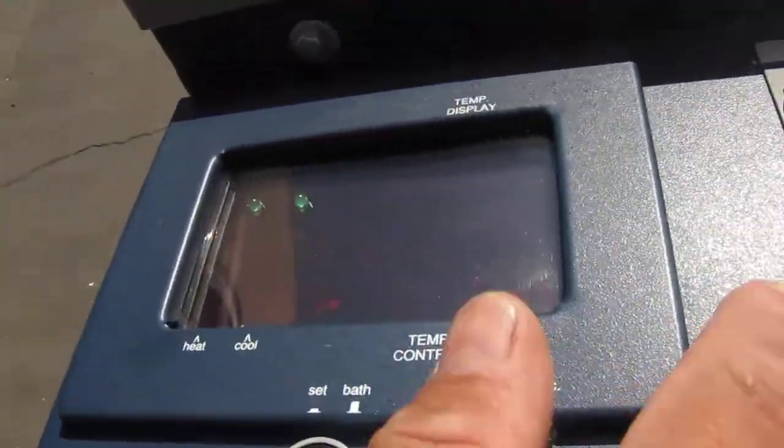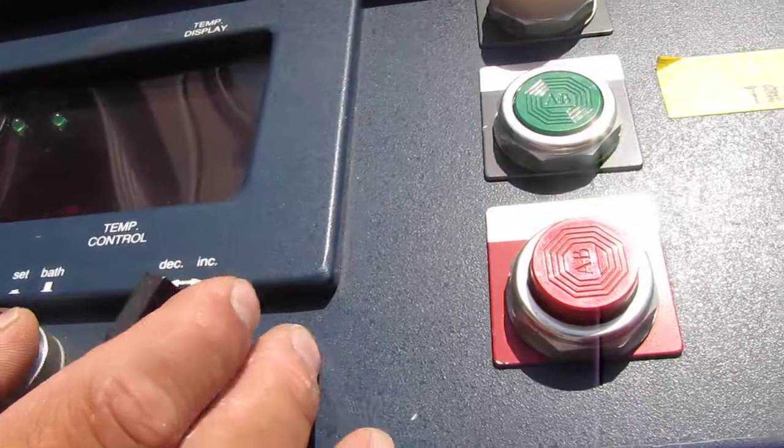Right over here are your controls. This is your start control. You can set your temperature with these buttons right here.